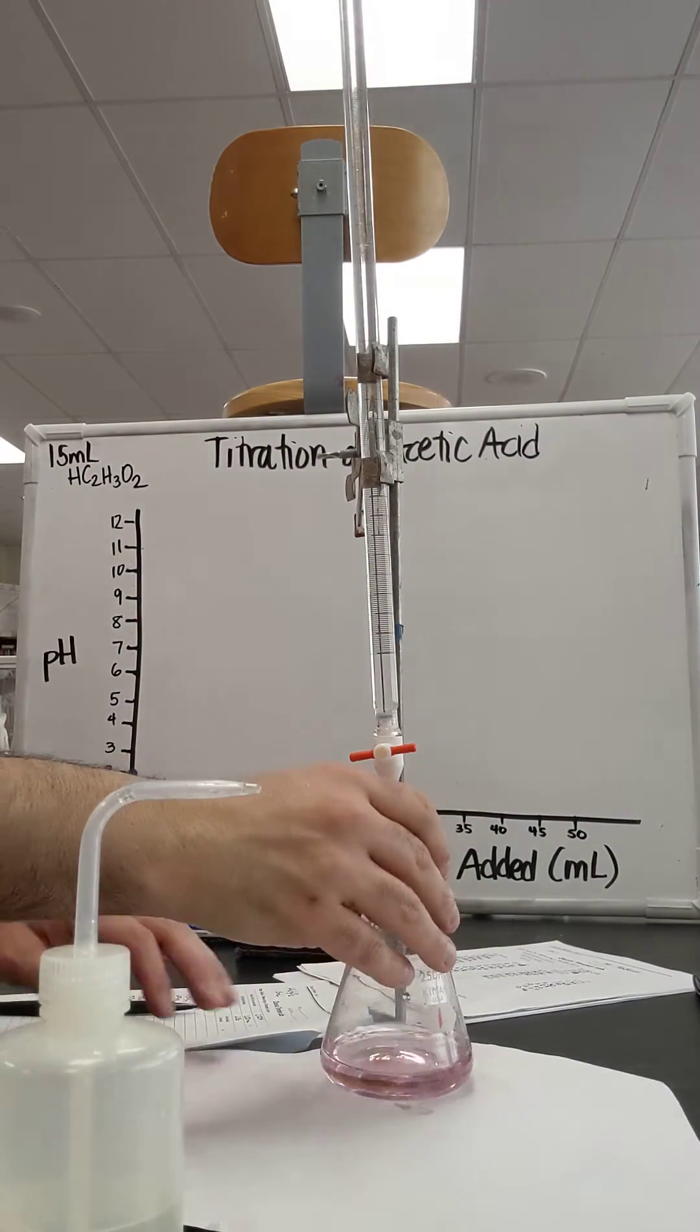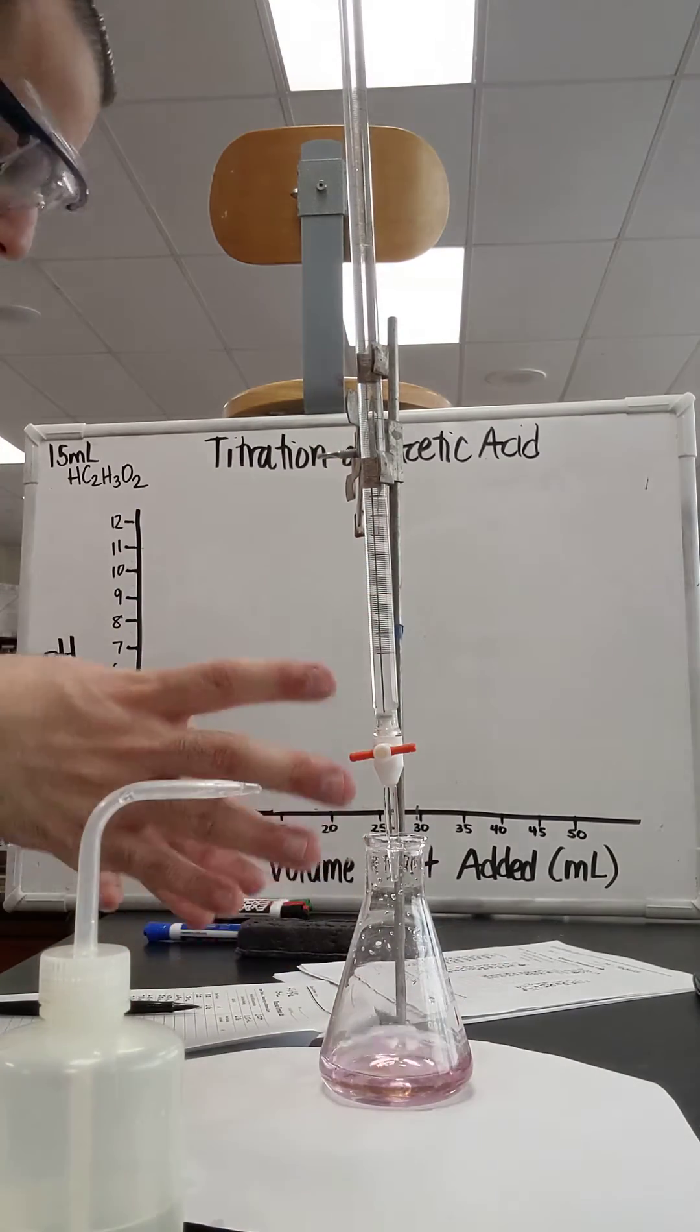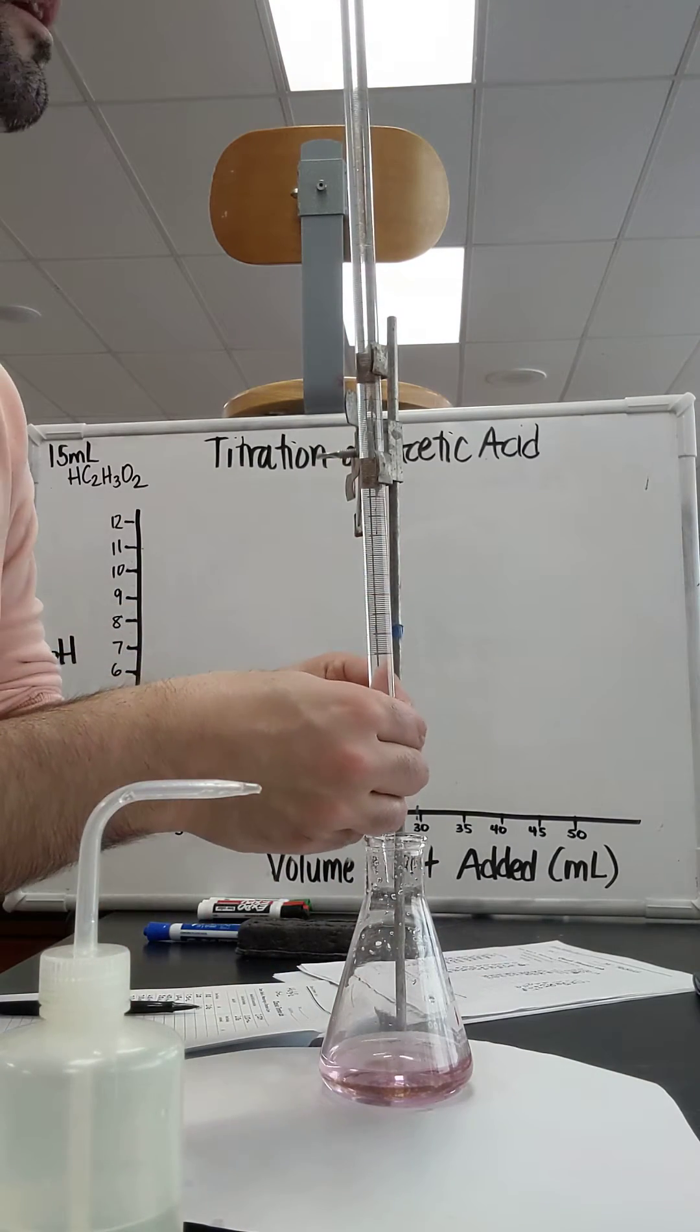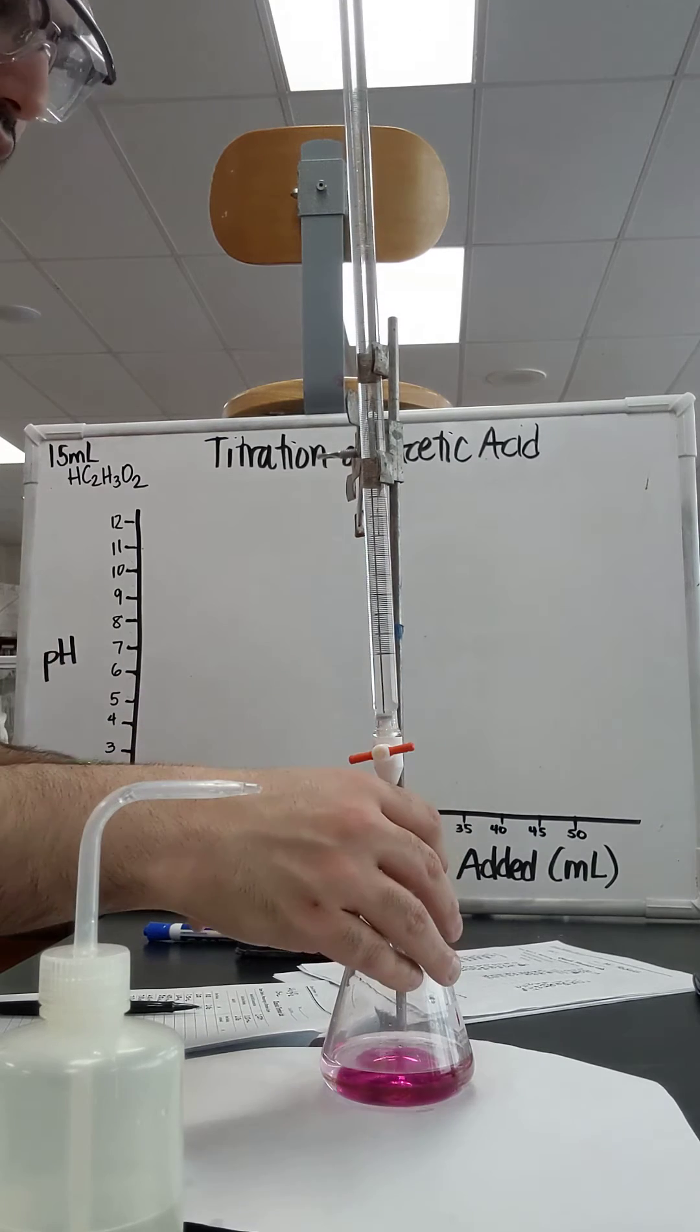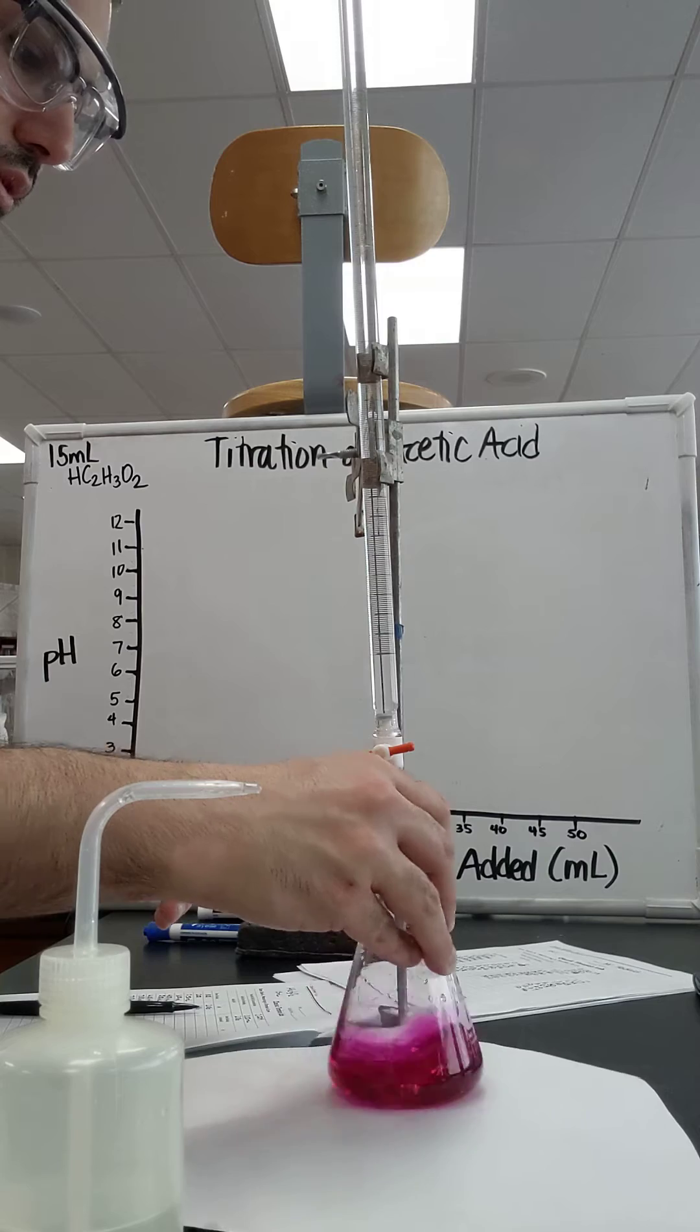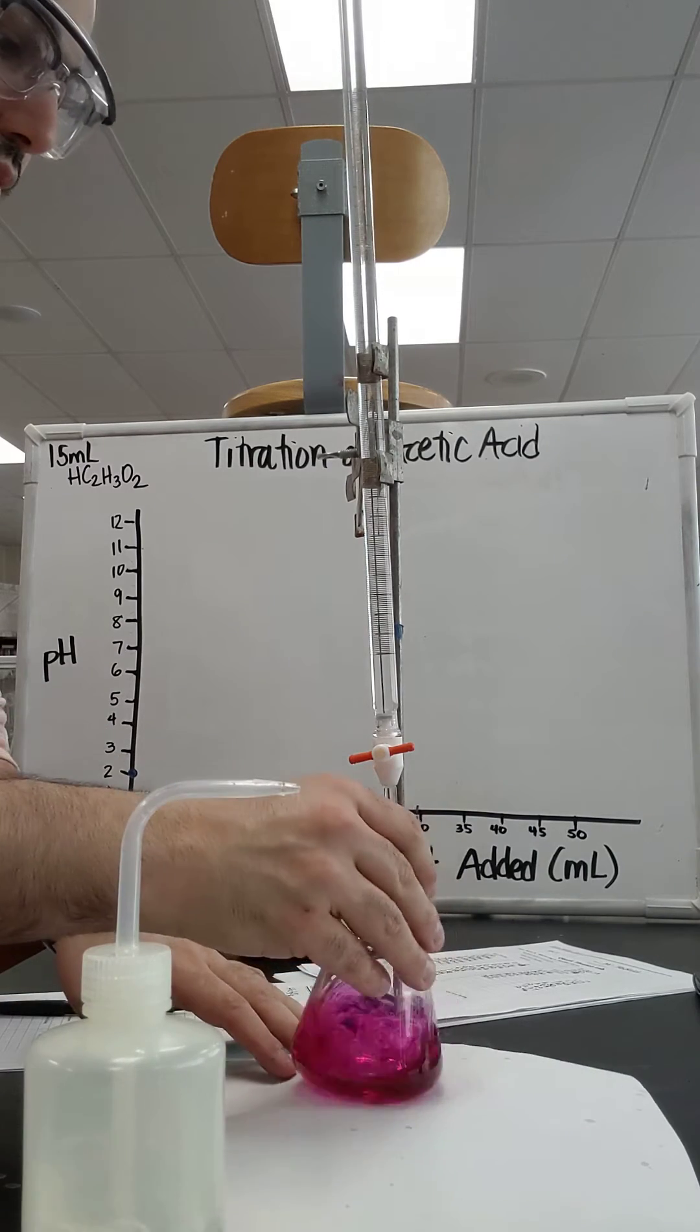Now it's faint pink a little bit more. Let's add maybe up to 9.5. I got a dark color. Swirl, swirl, swirl. Now I'm definitely past the end point.